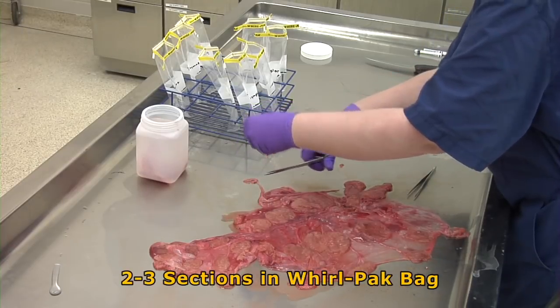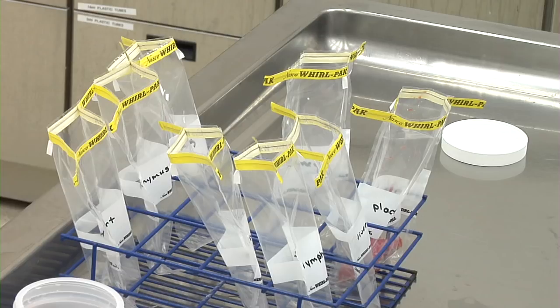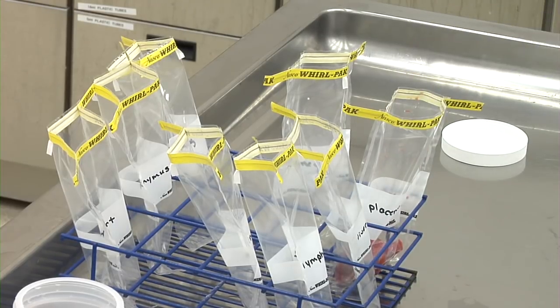Another two to three similar sections should be placed in a whirlpack bag. No other samples should be placed in the bag with the fresh placenta due to the possibility of cross-contamination.